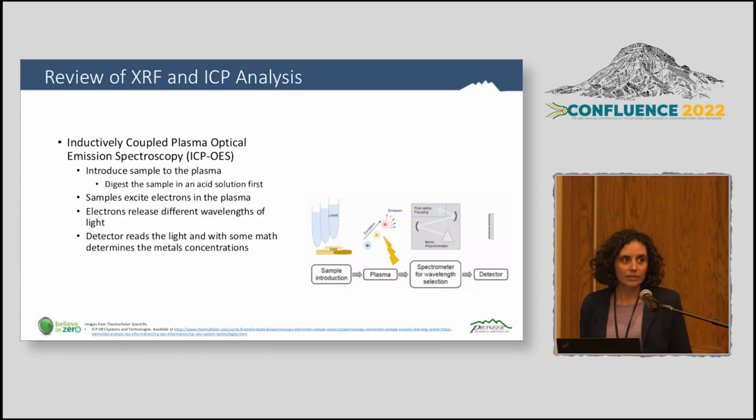So as you can see, just talking about this, there are oftentimes some issues with the XRF in reading metals concentrations. The soil matrix can sometimes cause interference. Other analytes within the sample can cause interference, and you may not get the most accurate sample results. But it is very helpful.